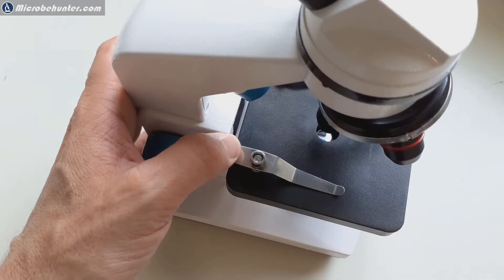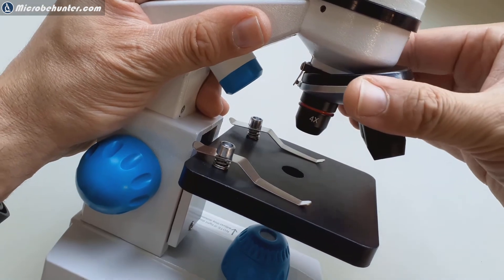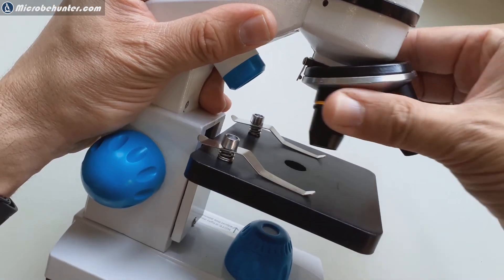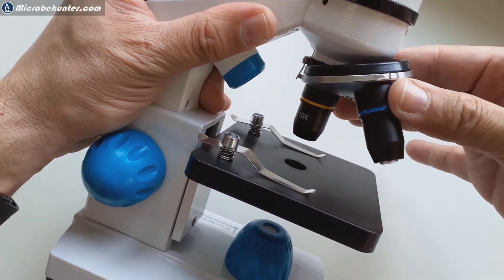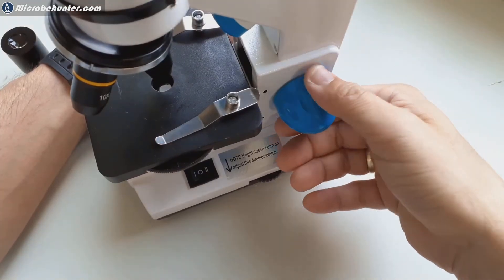And by pressing the back of the clip you're able to raise the clip for slides. The three objectives snap into place quite well.